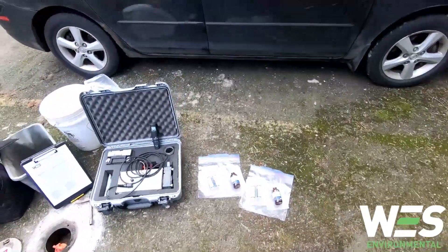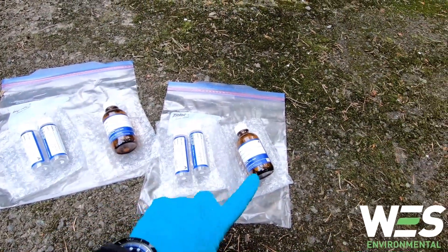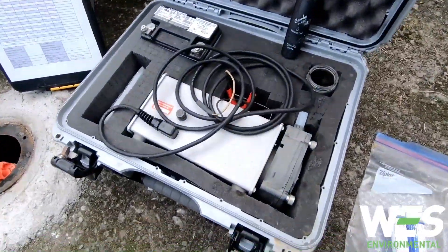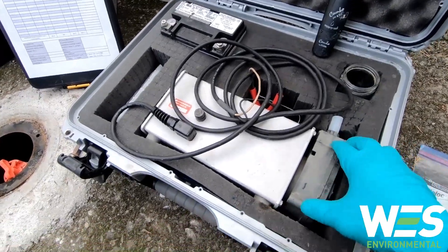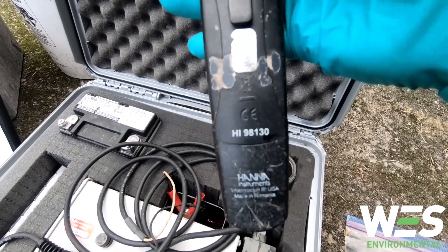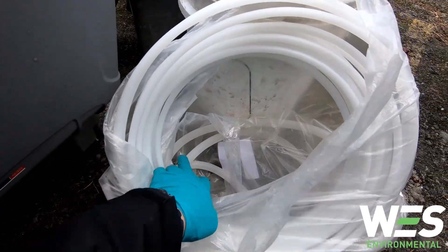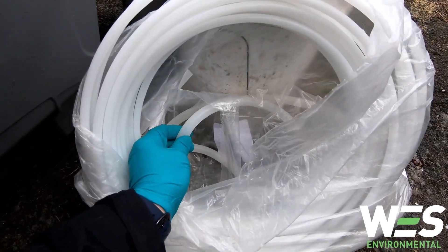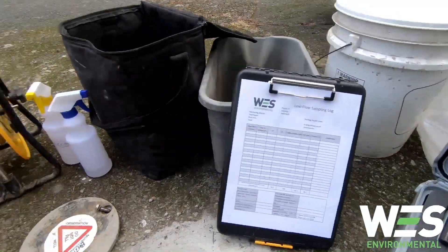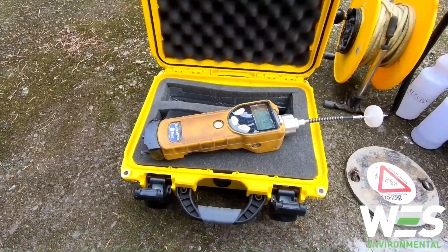The main things you're gonna need when you're low flow sampling are your sample bottles. Here I've got the regular sample and then a duplicate. You're gonna need your pump — this is a peristaltic pump. We've got the Hanna HI-98130. Here's the tubing I use for sampling, and then this is just more silicone tubing, and there's a couple of buckets here. I've got my sample sheet, my water level meter, water and alkonox, and then my VOC meter.